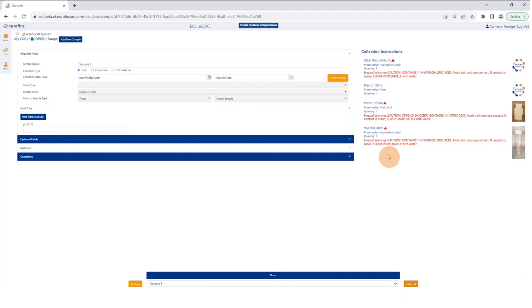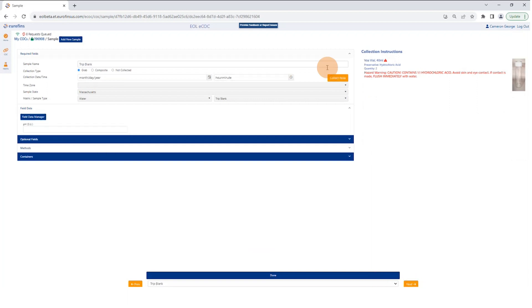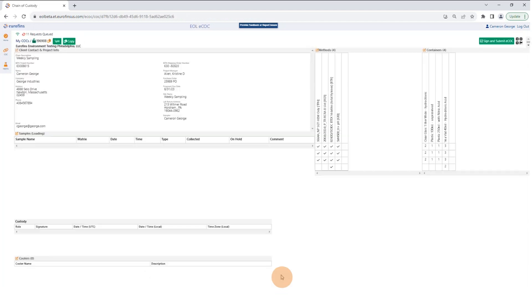In this example, I'm going to collect the third sample and put in a pH. I'll hit Next to go to my last sample, hit Collect Now, and then hit Done because I'm done collecting, which will take me back to the front page.